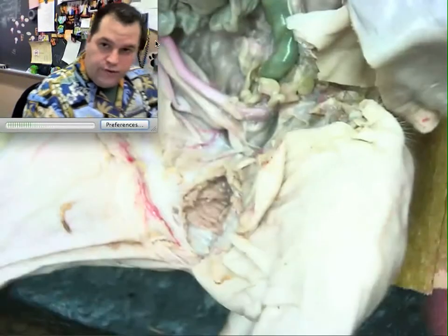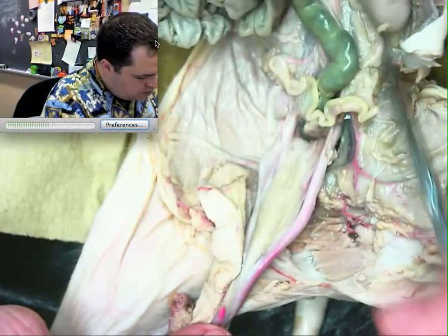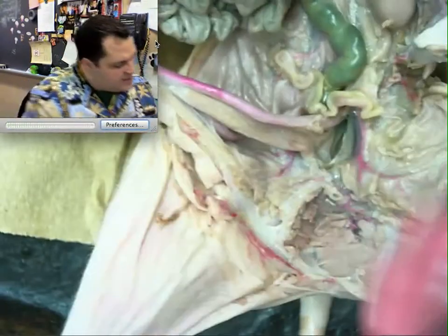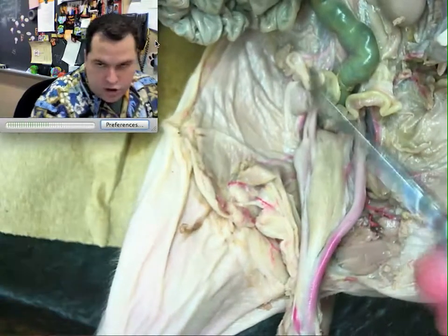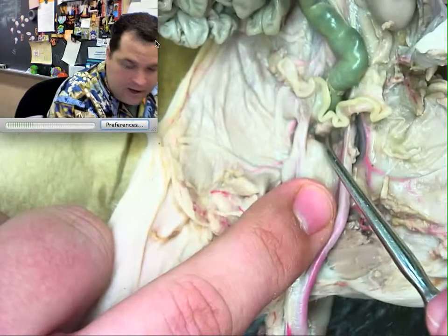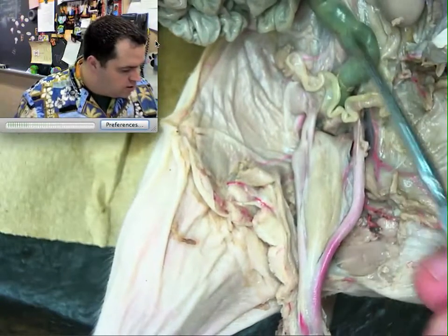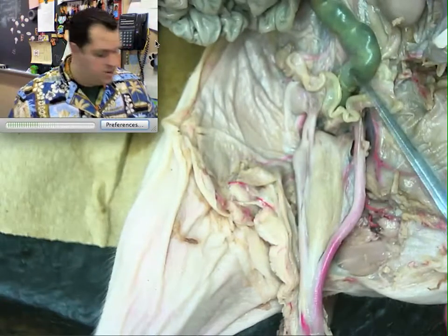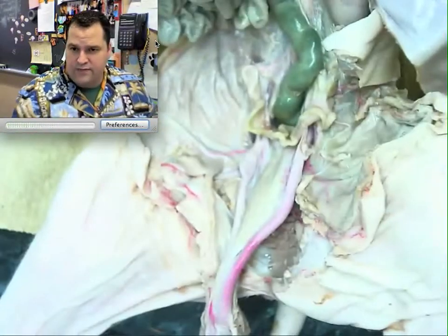Let's review the female anatomy: kidney, renal arteries and veins, ureter leading to the bladder, bladder leading to the urethra where urine exits. For reproductive structures: ovaries, fallopian tubes or horns of the uterus, and then the uterus itself right here. Just to give perspective, this large structure here is the last part of the large intestine, and this part here would be known as the rectum.